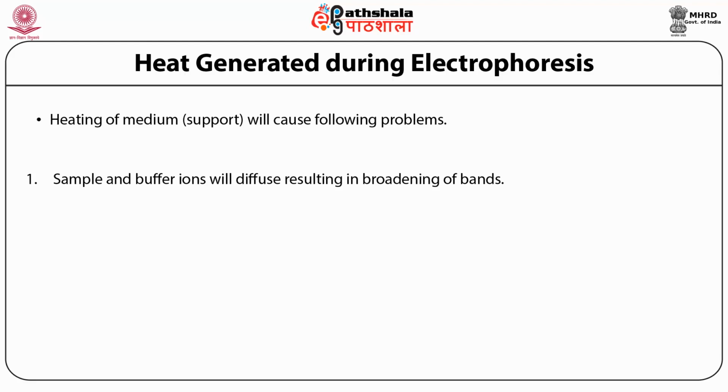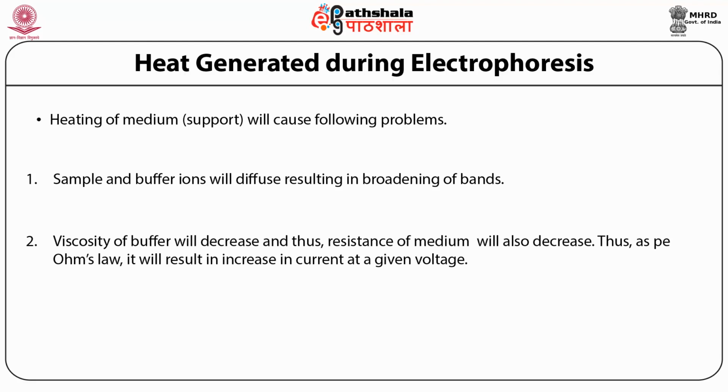It can also decrease the viscosity, and thus the resistance of the medium will also decrease, and as per Ohm's law, it will result in an increase in current at a given voltage. So by increasing the temperature, the current will increase, and further increase in temperature will result in more increase in current and more generation of heat.